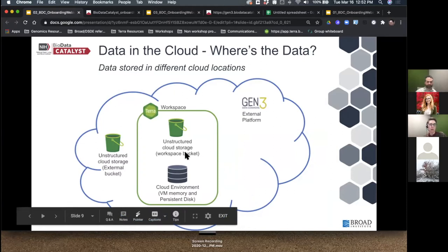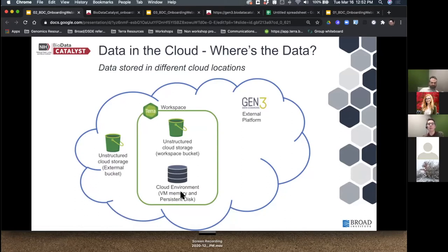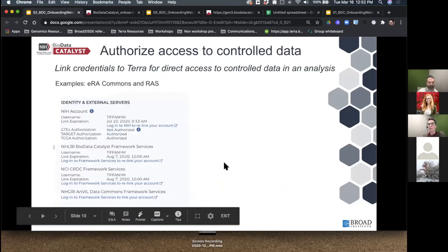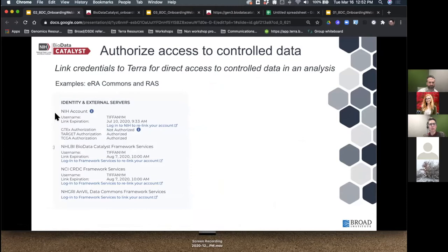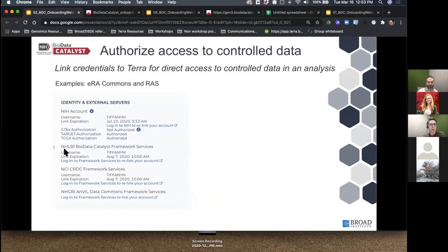Here's the data library, which conveniently includes TOPMed data specifically aimed at BioData Catalyst users. The data in the Terra data library is actually hosted elsewhere in the cloud — stored in different cloud locations in unstructured cloud storage. This includes Google Buckets outside of the workspace, the workspace bucket inside the workspace, and unstructured storage managed by platforms like Gen3. In addition, there's data on the cloud environment VM and persistent disk.